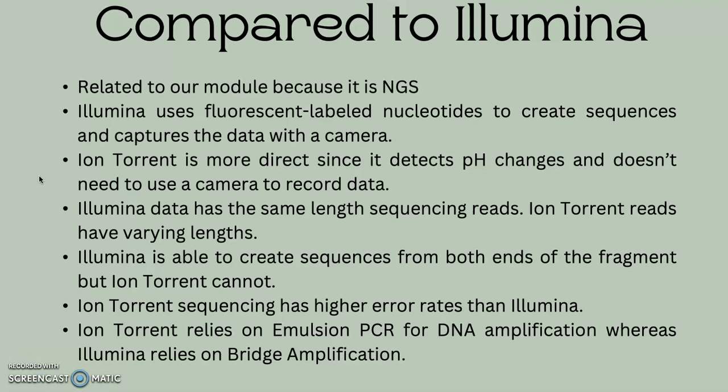How does this relate to what we're talking about in lecture? In Module 2, we've heavily focused on next-generation sequencing, of which ion torrent is a form. However, I wanted to compare ion torrent sequencing to Illumina, since that's what we've been focusing on.